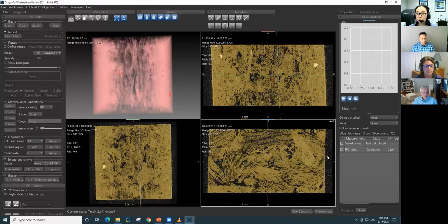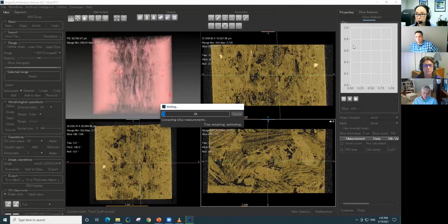All right. So we just did the slice analysis, and let's click this one. I thought I just did. I guess I didn't check this one. Sorry about that. 29 seconds. All right, so here we'll do a couple of quick questions while this is ticking through.